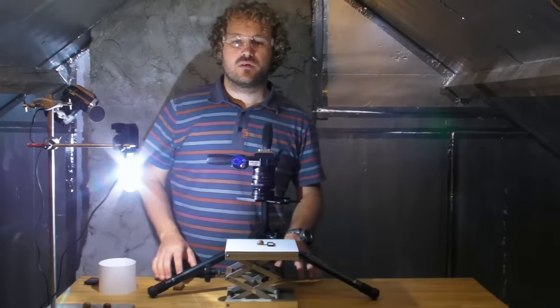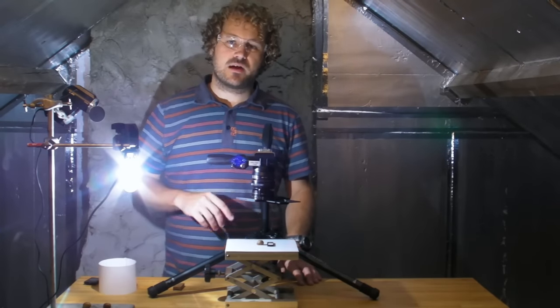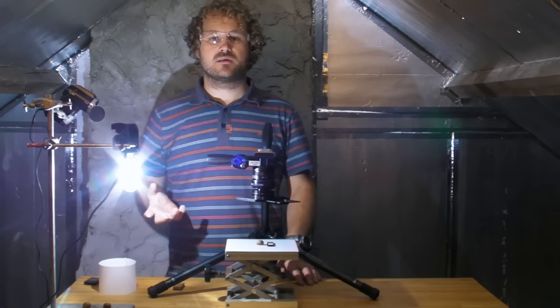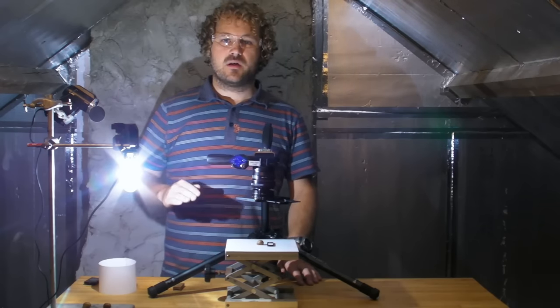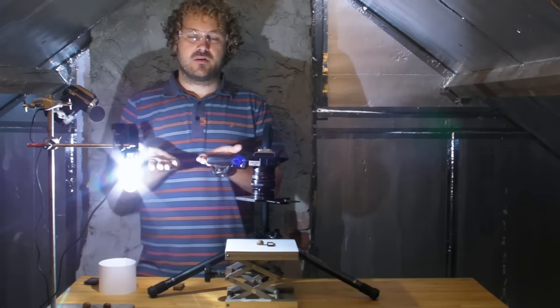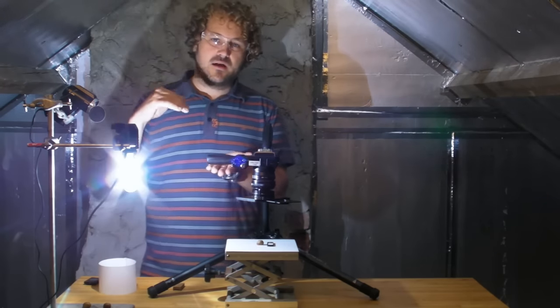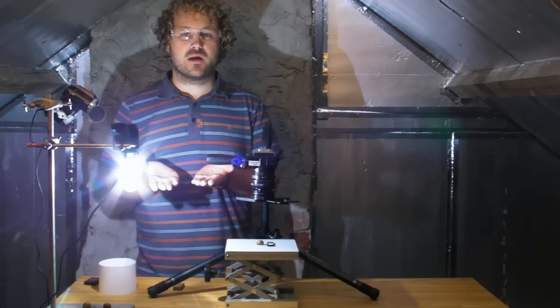With all objective photography, it's very important to consider the lighting in your setup, how that lighting is interacting with your grey standard, and how it's interacting with the object you're trying to measure. Now, imagine the case of a butterfly wing. There you have a flat surface, so you can place the flat grey standard in the same plane. Any light hitting the grey standard will also be hitting the butterfly wing. So that's a very simple case.